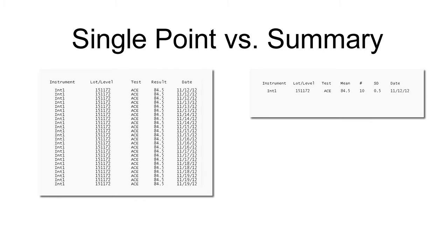Single Point requires you to enter individual points for each test. Summary data entry includes a mean, SD, and number of points for each test.